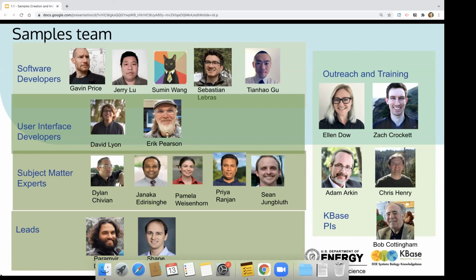And there's another question here. I might have missed it, but is Enigma the best template to use right now if you have lots of data from subsurface wells? It is more supported. It has the fields that are understood, but not really. I'll let Shane answer that.